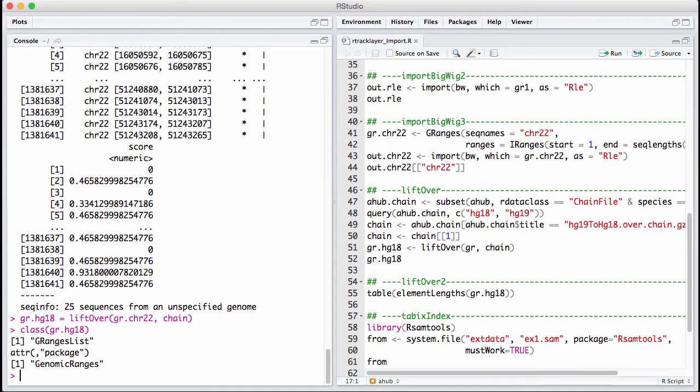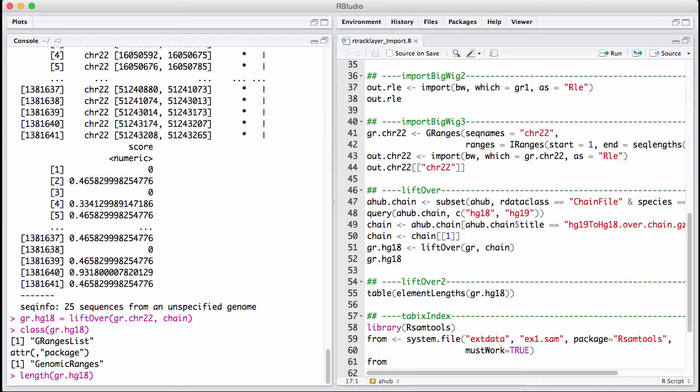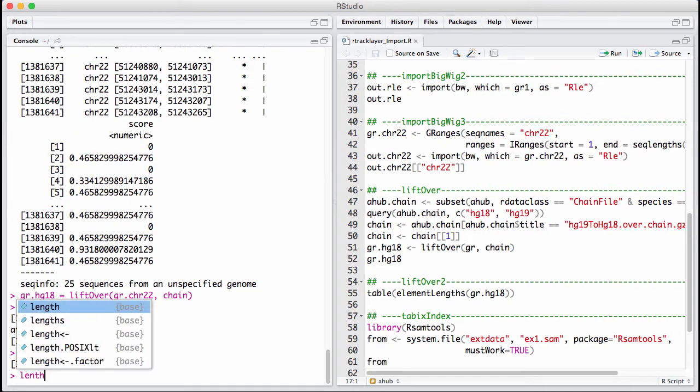It turns out what comes out of this is a GRangesList. The reason why it's a GRangesList is that each of these ranges could conceivably be split into one or more pieces when we move it from one genome to another. The length of the GRangesList is the same as the length of the original GRanges we lifted over.